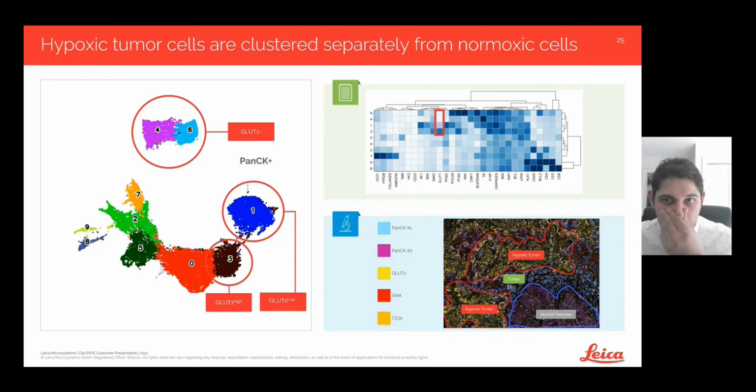So here in this cluster diagram, each biomarker is along the x-axis, and cells are clustered based on biomarker expression similarities across the tissue. For example, based on the epithelial markers PCK26 and AE1 and the UMAP spatial relationships, we're able to identify normal pancreas up here and visualize the clusters separate from the tumor cell clusters.